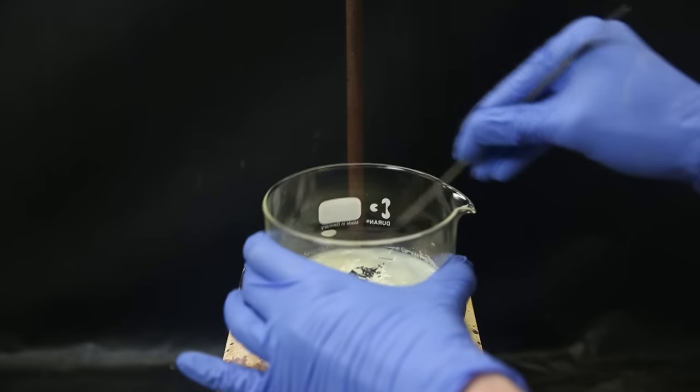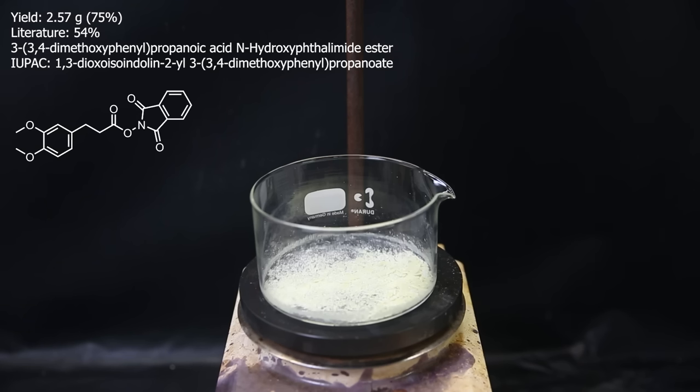And then scrape it all off, and I am left with 2.57 grams of what should be the product. If it's pure, that would mean the yield is 75%, which is higher than the literature. But it probably isn't. Though having a bit higher yield isn't too suspicious since it seems that the solvent used for the column in the literature wasn't the best for this compound and I did modify it a bit.